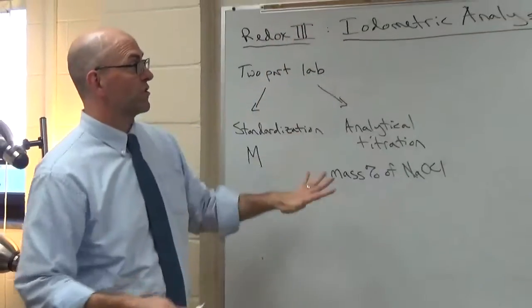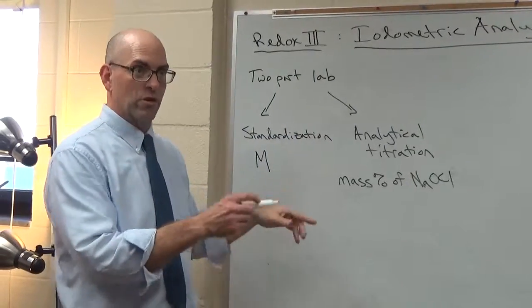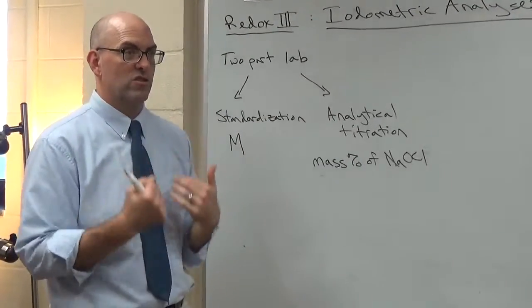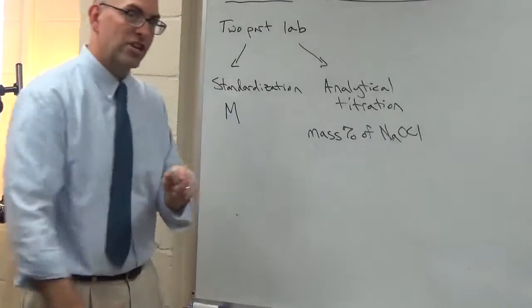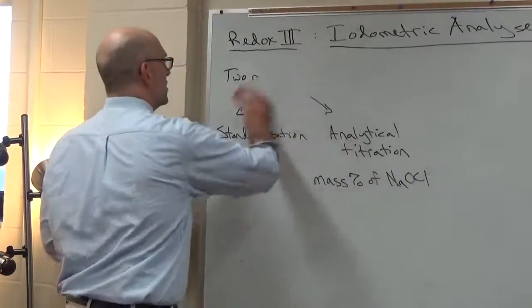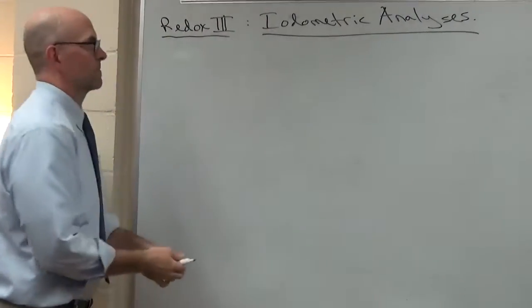Now, I'm not going through all the calculations here because it involves molarity calculations, it involves titration calculations where you have to do mole to mole conversions, and all those stoichiometry things that you've learned in lecture. So I'm not doing the stoichiometry. All I'm going to focus on is balancing an equation that's similar to the 2 equations you'll balance in this lab. This one's a little more challenging to balance, but I'm not going to do those for you. I'm going to do one that's similar.